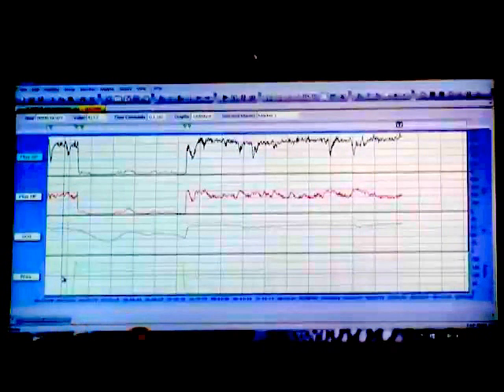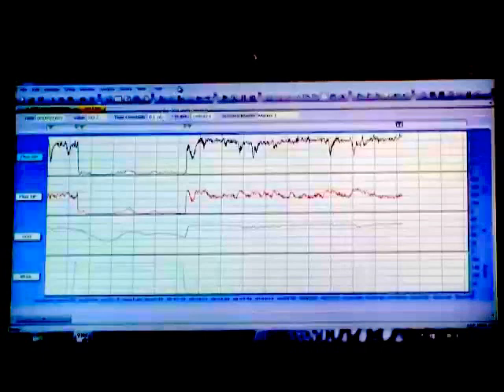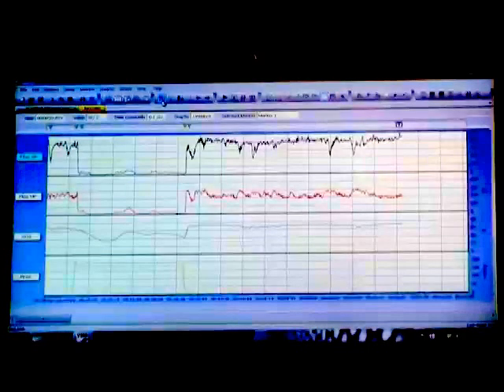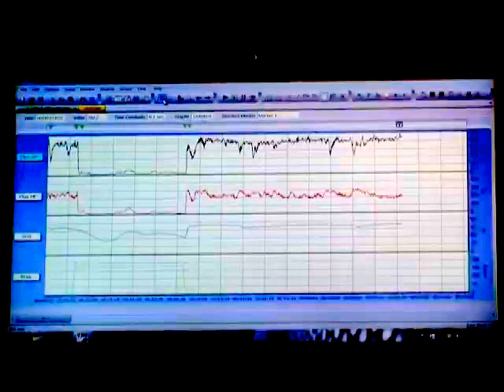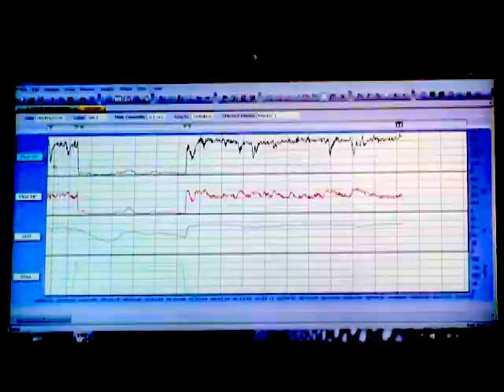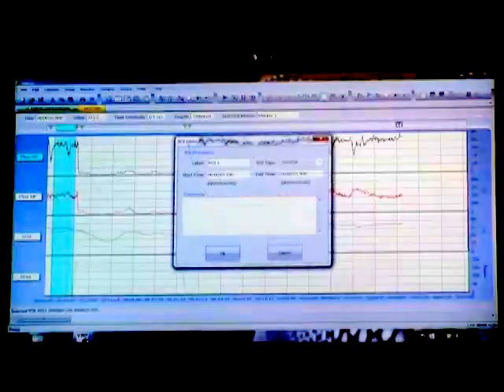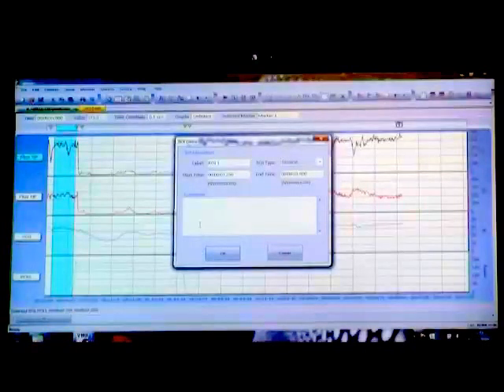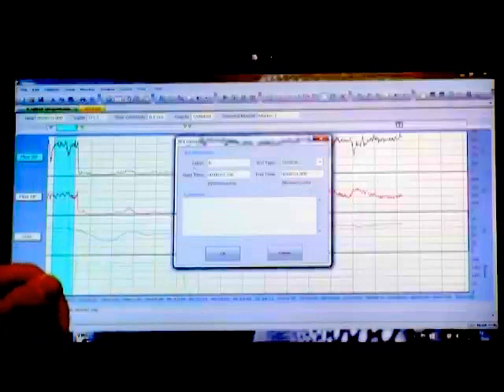As well as the automated analysis, you can review the data by inputting manual regions of interest. This is done using Shift and Insert shortcut keys, or by clicking this icon on the desktop. By a single click of this icon, you can draw the various regions which you're interested in capturing and retrieving specific information or data from. You can label these regions, so we'll call this specific region baseline.